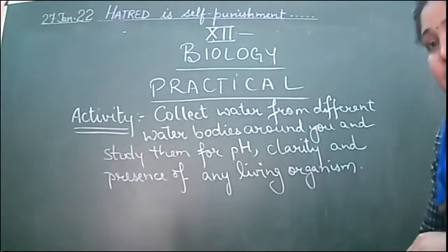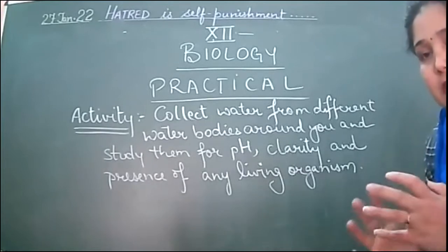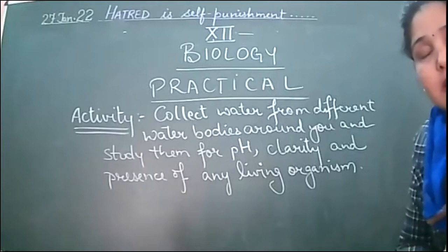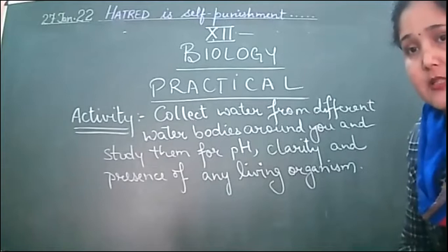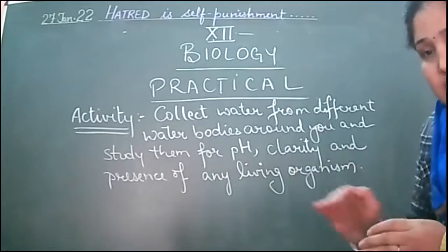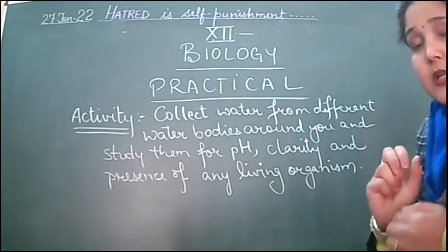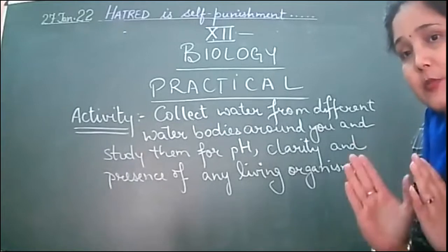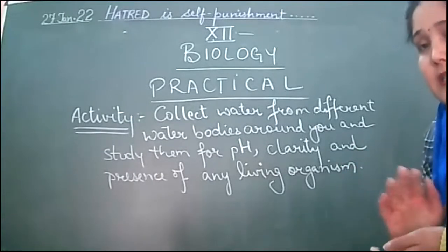You have to show this slide to the examiner when you get it checked. The slide has to be shown on the compound microscope, provided your slide has the particular organisms that you need to show, and you need to give as an observation that this sample has a lot of microbes and this one has fewer microbes in comparison to the other sample.